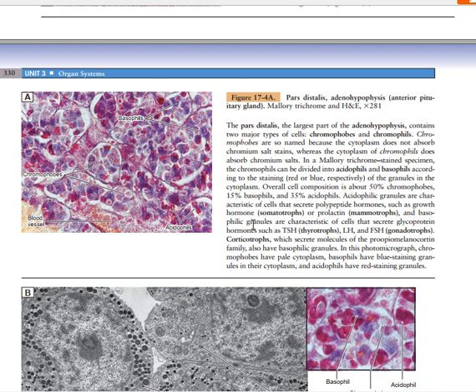Why the basophilic granules are generally characterized now to secrete thyroid stimulating hormone and follicle stimulating hormone. Is it clear? Now the corticotrophs, which secrete molecules of proopiomelanocortin, also have some basophilic granules, but you can also think of corticotrophs more as chromophobes. So corticotrophs are more chromophobes, but they have only some basophilic staining.